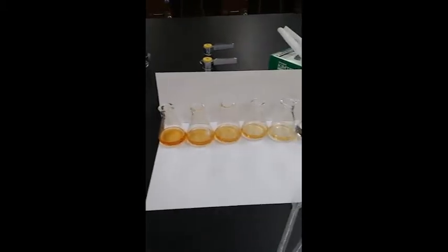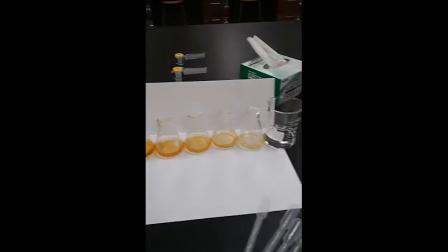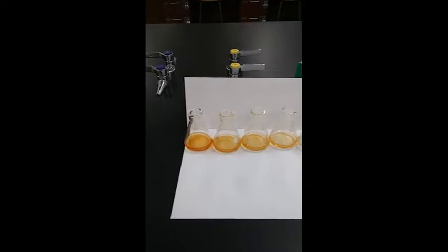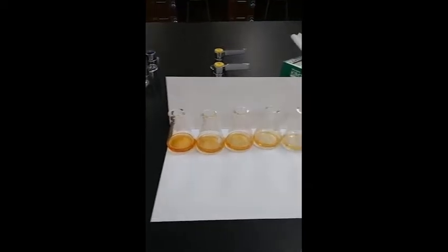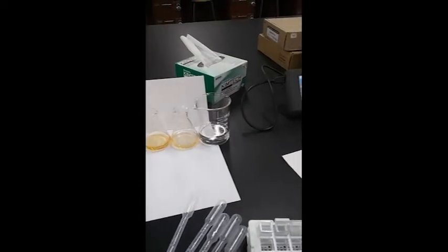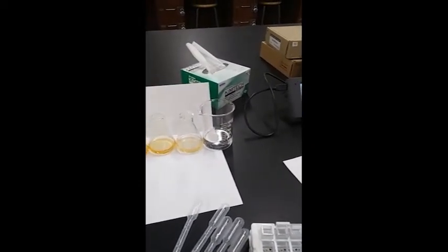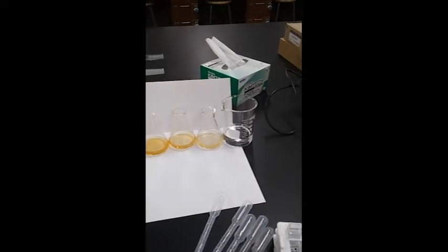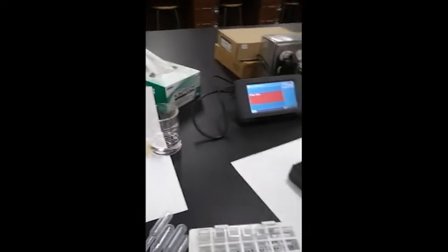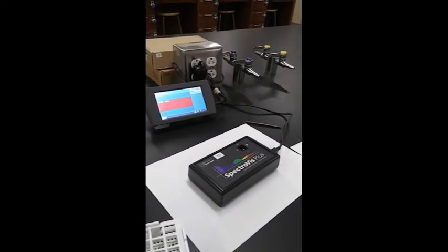I've produced the five standard solutions. Clear from the white background, these five solutions vary in concentration from most concentrated to least concentrated. In the beaker, I have the nitric acid solution. We're using nitric acid as a solvent, and as such, we want to be sure to use nitric acid for our blank when it comes time to calibrate the SpectreViz probe. Let's get started, shall we?